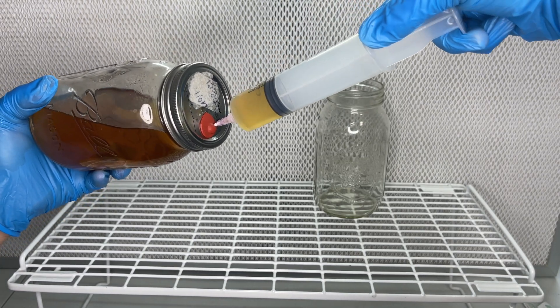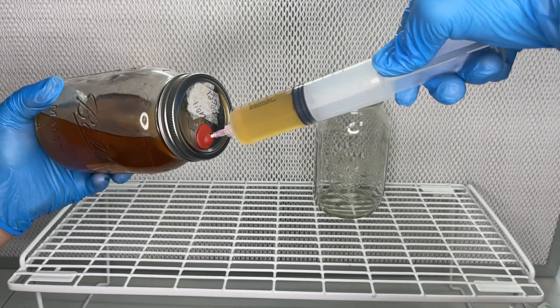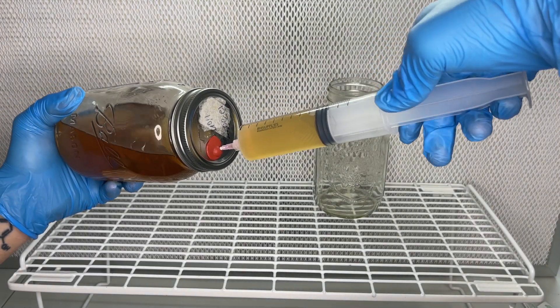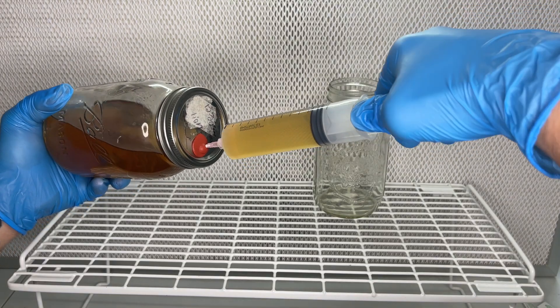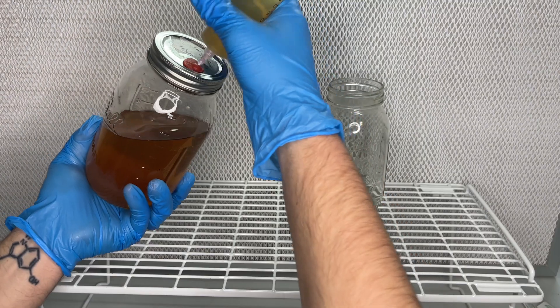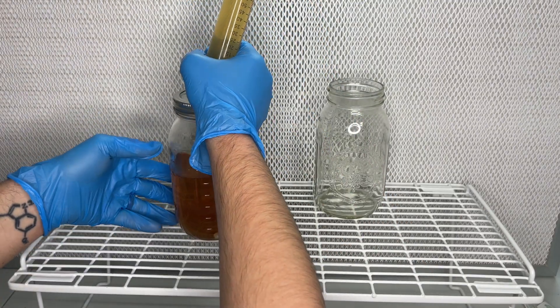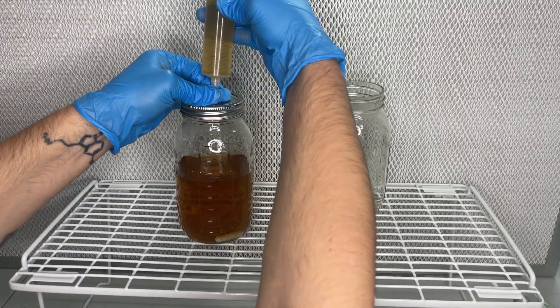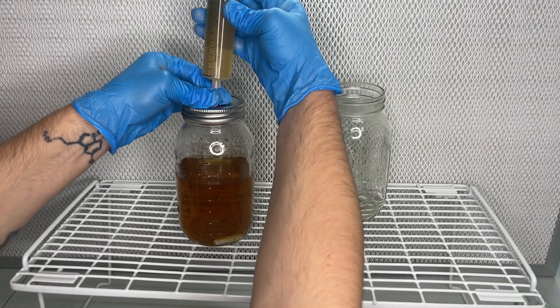These heavy duty 60ml syringes are hard to pull back, but it definitely beats extracting 10ml at a time. I usually only do 3-4 pulls, taking about 200-300ml out of the jar, and it only takes me a few minutes.